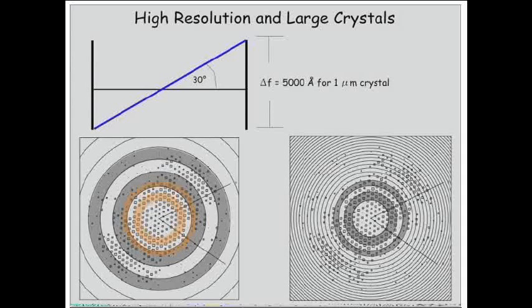And then we go to the next positive zone there, and those remain at the other end within the positive zone. But beyond that, we are in the negative zone, and yet here, they were still in the positive zone. So the spots will have reversals in contrast that are different at different ends of the crystal. So you can't assume a single defocus value.